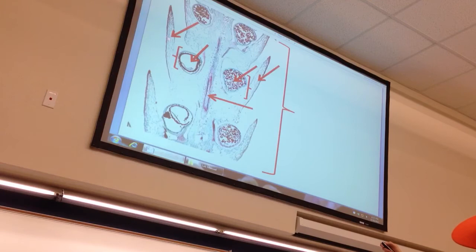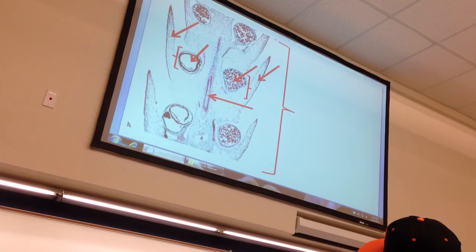And then coming over here, what's this pointy thing? Megasporophyll. If you put macrosporophyll, you can count it. And then this whole bigger structure is a megasporangium, megaspores. And then what's the structure down the middle? The stem. Exactly. So strobilis is a stem with leaves attached to it, but it's specialized in forming spores.